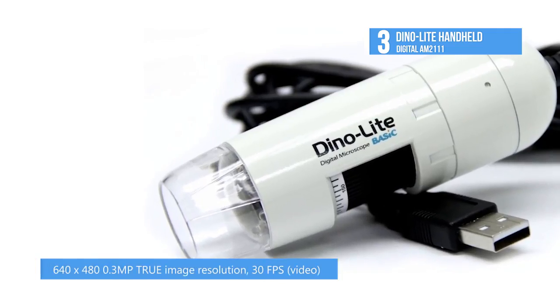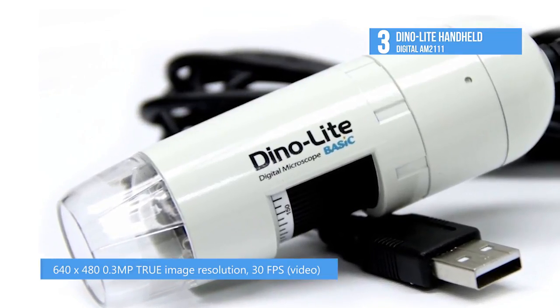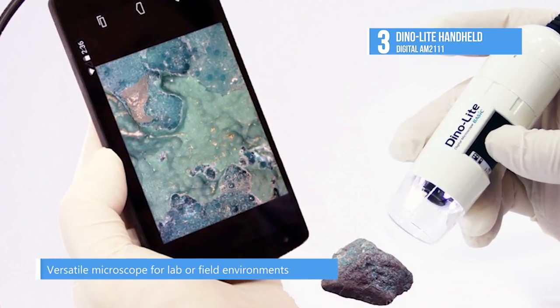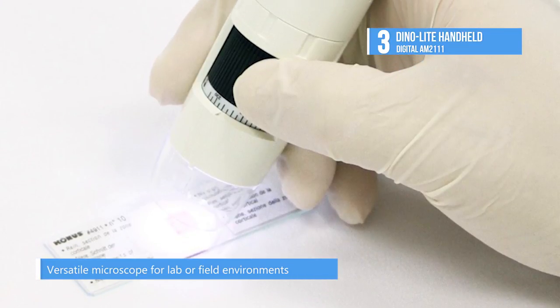Its features include magnification up to 200 times, the capability of interfacing to the PC, adjustable focus, quick and easy installation, and stylish design. The Dino Digital Microscope provides high-quality microscopy video interfacing to PC.